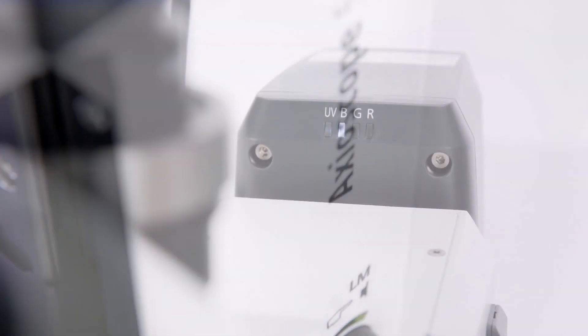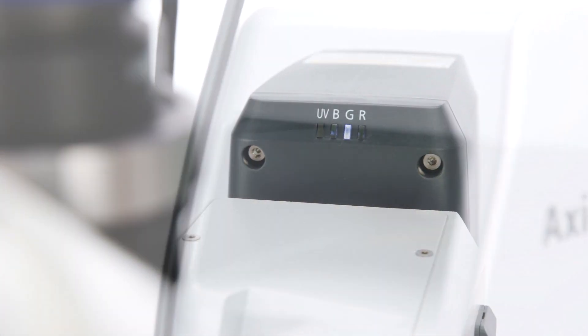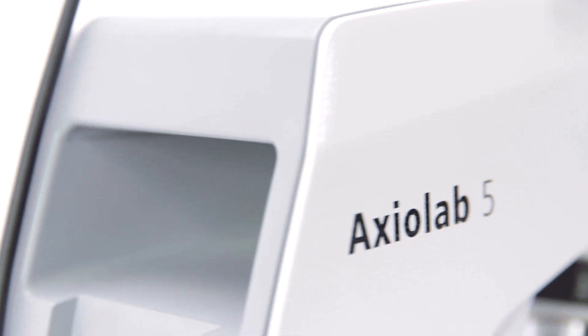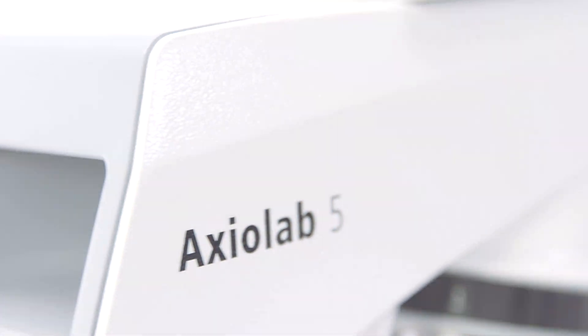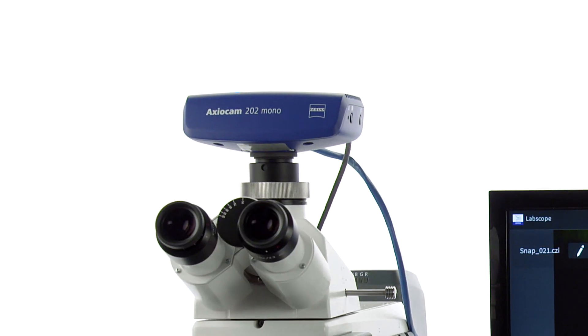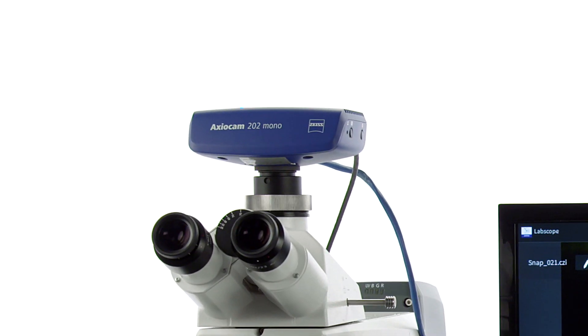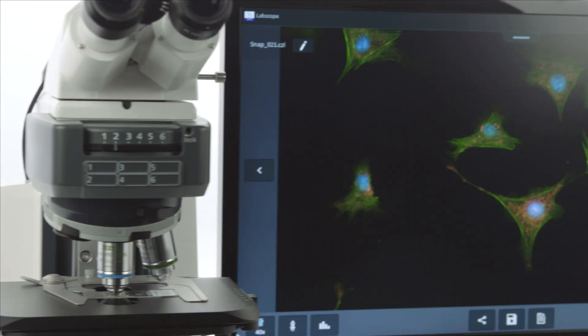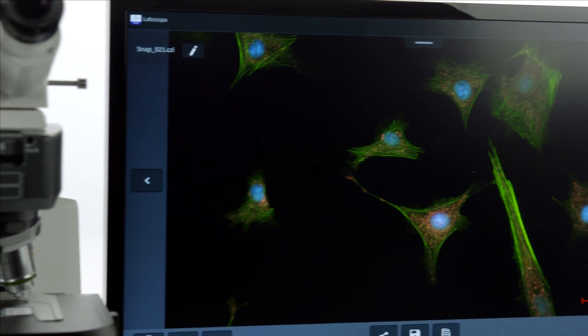All you need is a smart fluorescence microscope such as Zeiss Axioscope 5 with Colibri 3 or Axiolab 5 in combination with the microscope camera Axiocam 202 Mono and the imaging app LabScope.